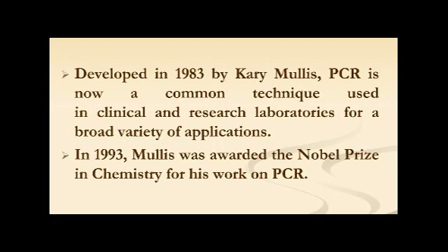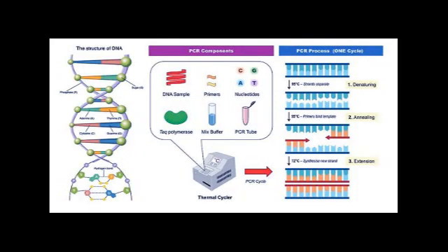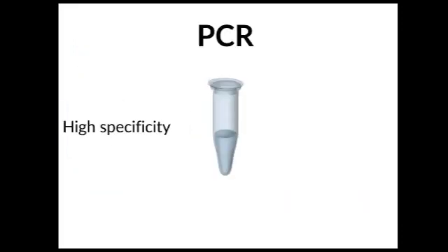The basic principle of PCR technique is based on the enzymatic replication of DNA. In PCR, a short segment of DNA is amplified using primer-mediated enzymes. DNA polymerase synthesizes new strands of DNA complementary to the template DNA. The DNA polymerase can add a nucleotide to the pre-existing 3'OH group only. Therefore, a primer is required. Thus, more nucleotides are added to the 3' end of the primer.